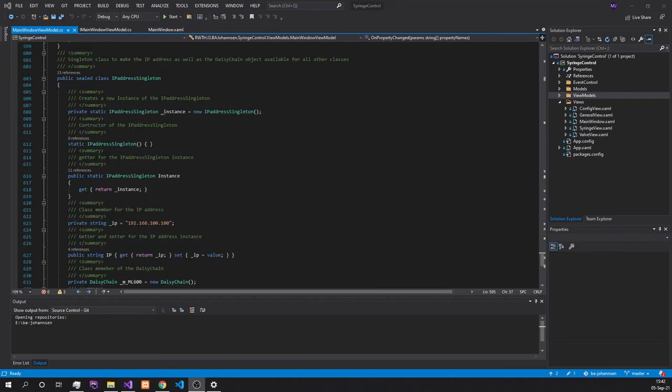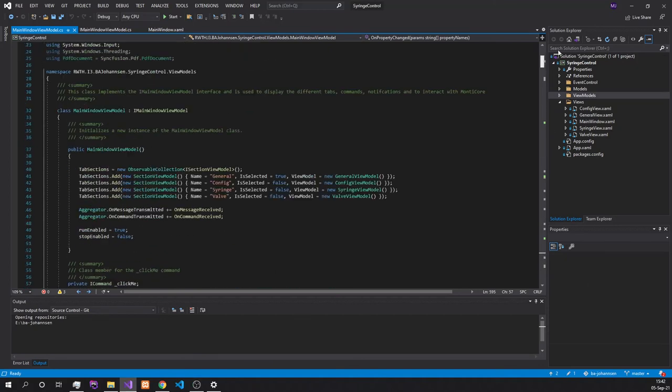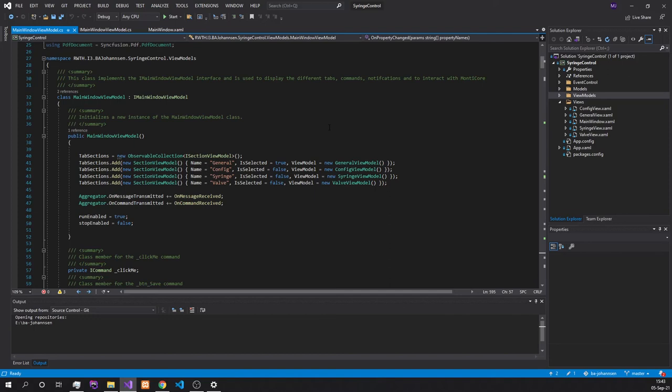It is also important to note that we are using a singleton class for the IP addresses as well as the daisy chain. Thus, it is important for the development of a new view that the developer is also referencing the IP address instance in the singleton as well as the daisy chain if they are wanting to execute functions from the API. The reason for this is due to the fact that we are always creating a new instance of the view. We also need to connect to the syringe pump new to access the functionalities in the specific tab. Thus, with the creation of a singleton, we only need to connect once to the syringe pump to have access to the functionalities without needing to connect new.